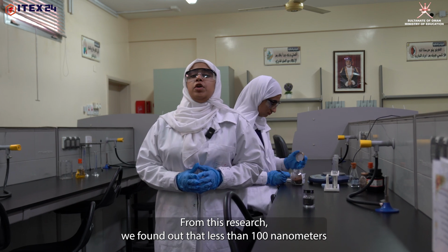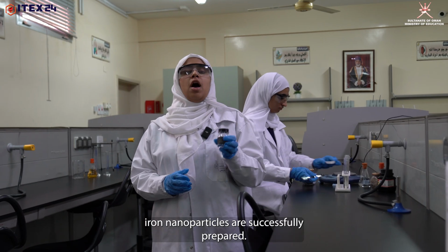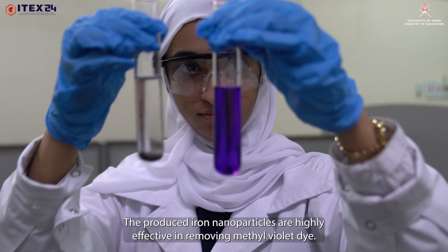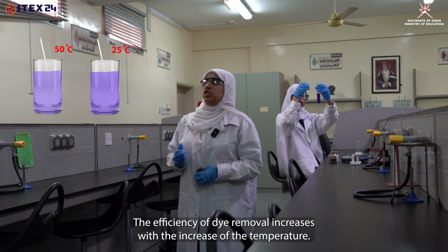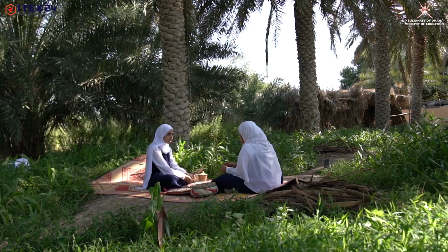From this research, we found out that iron nanoparticles of less than 100 nanometers are successfully prepared. The produced iron nanoparticles are highly effective in removing methyl violet dye. The efficiency of dye removal increases with the increase of the temperature.